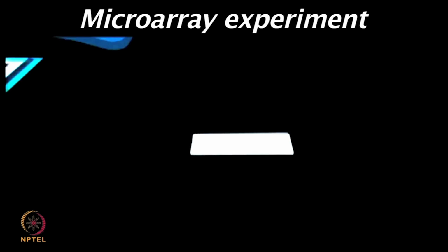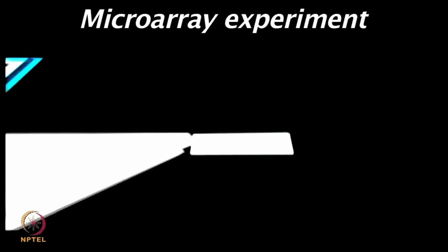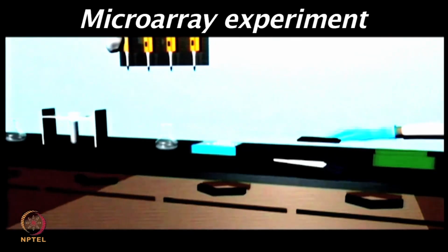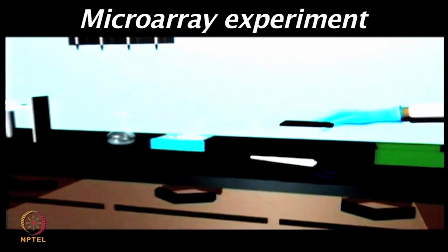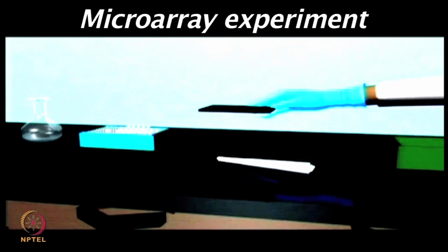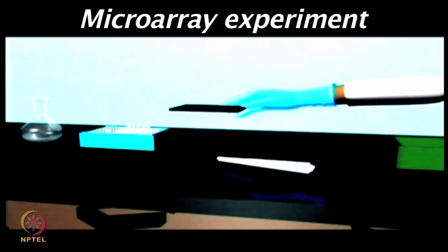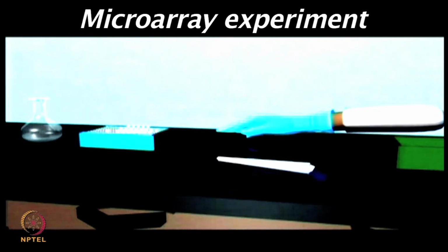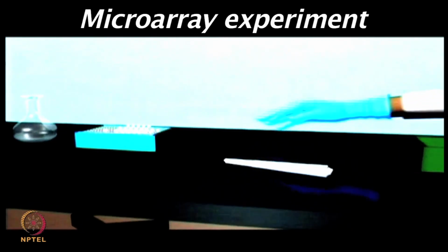Once you are ready with the appropriate dilution of the serum, then you can apply those on the chip surface and place the cover slip for an hour. Similarly, you can add the primary antibody and then place the cover slip. As I am mentioning, these are generic steps which could be used for a variety of applications.